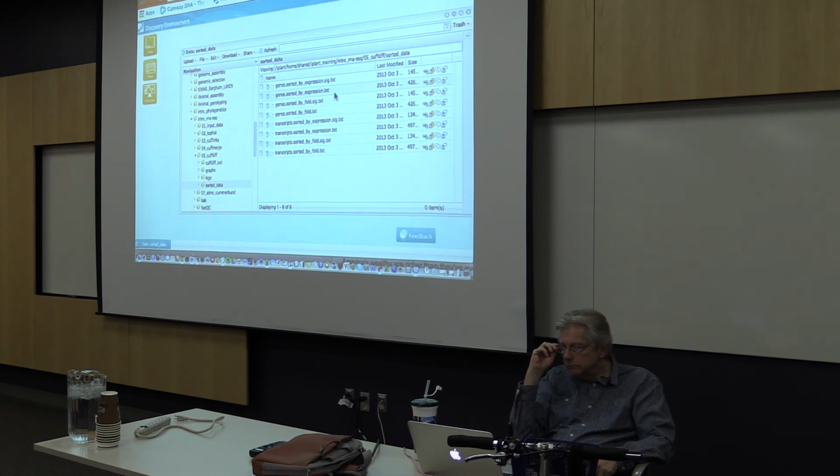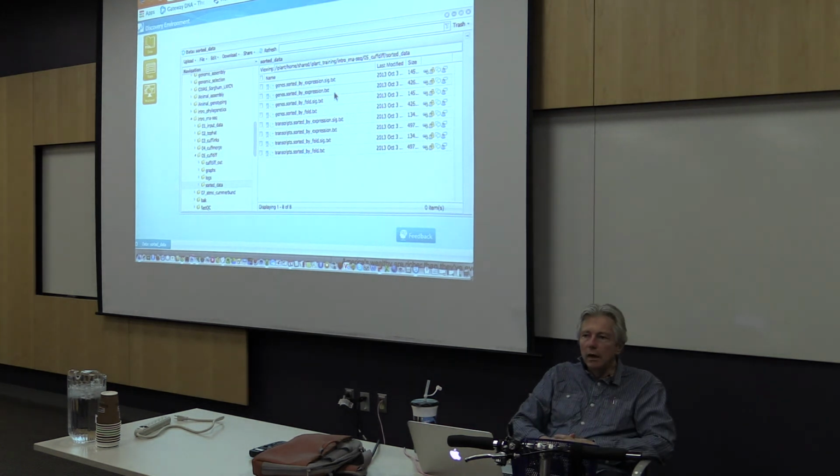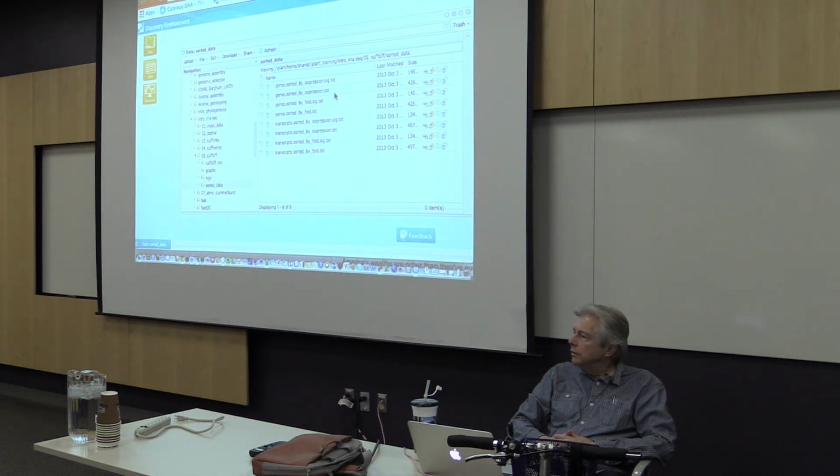But I recommend going through, testing this out for yourself. You should be able to do drag and drop, click and point. And if you have any questions, I'm available, and I'll turn it over to Erica.